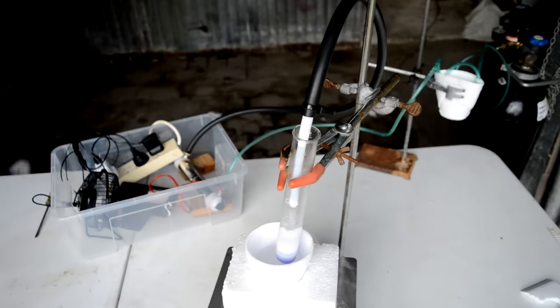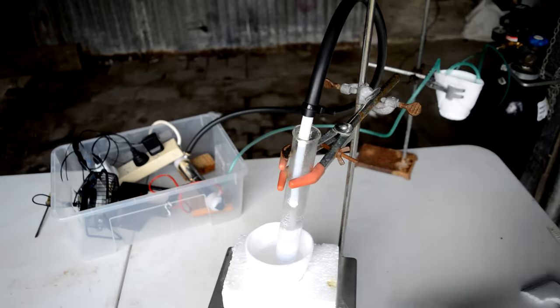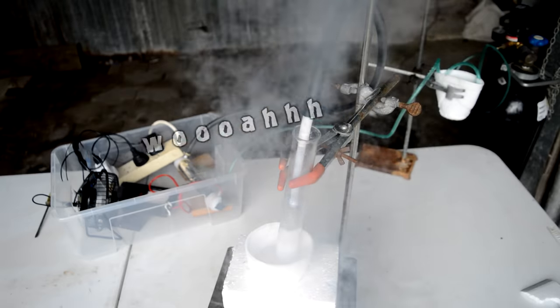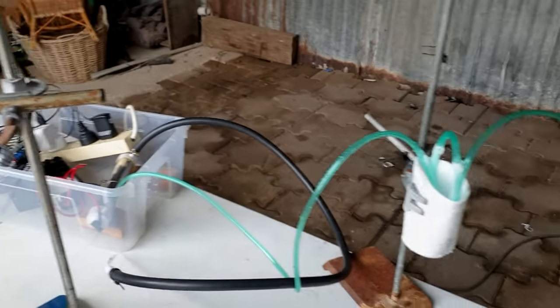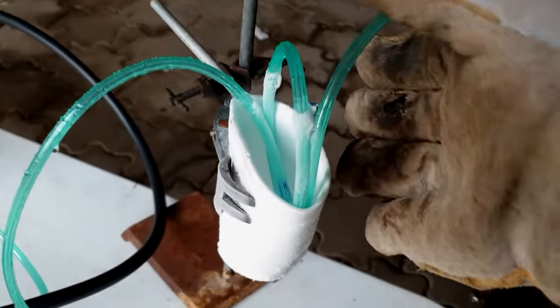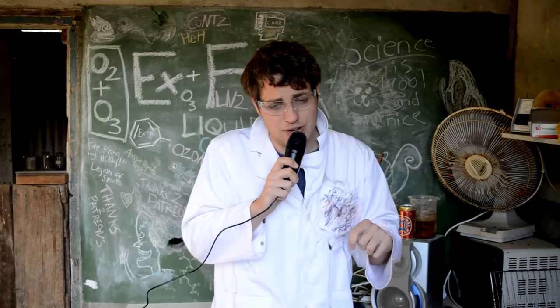So if we just sit here and wait, something might happen. Now that wasn't an explosion, but initially I thought it spontaneously boiled. That is not the case — looking back on the footage, you can see that the gas actually comes down the line forcing all the liquid out of the test tube. But the regulator is off, so where did all that gas come from? The ozone flowed back the other way — some liquid ozone exploded and forced gas through the line and blew the stuff out. It's probably a sign the liquid ozone has had enough.